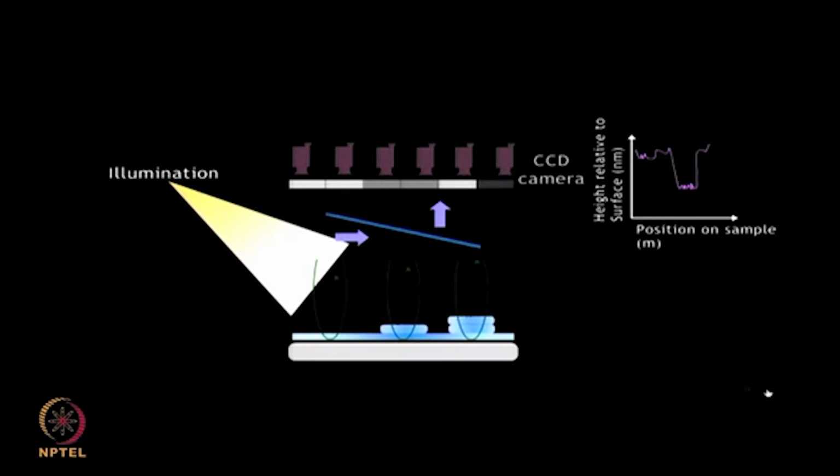Binding of the target to the immobilized biomolecule further increases the optical path difference, and it is shown as a shift in the spectral reflectivity.